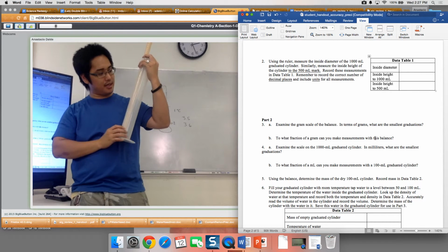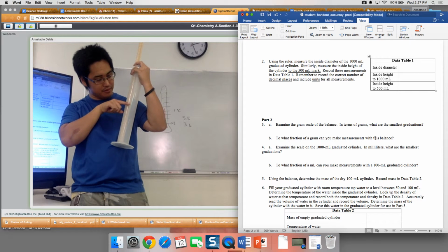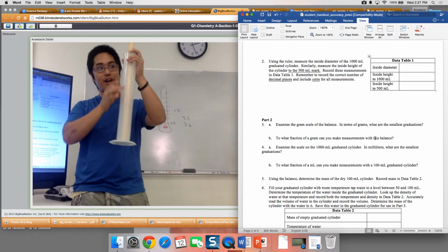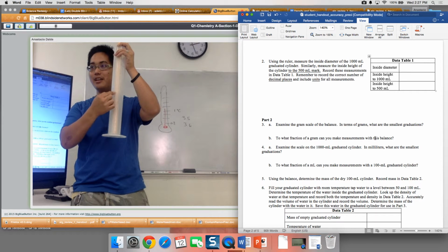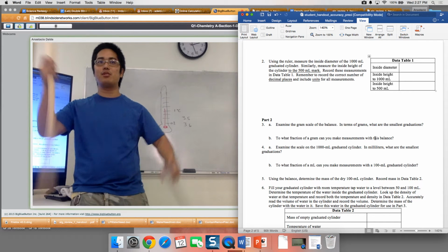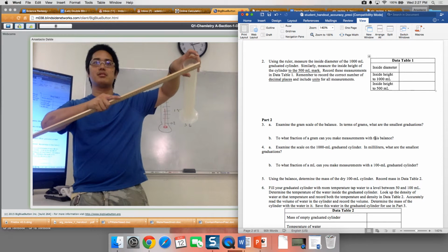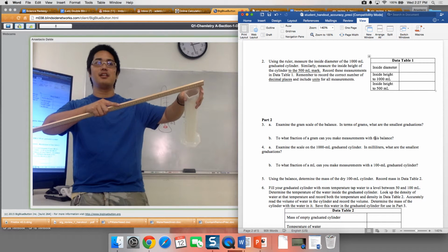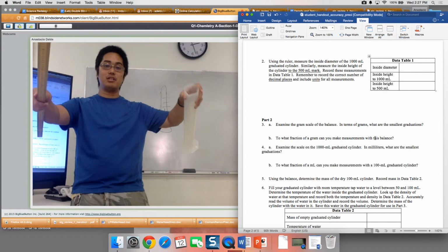And I asked you to get the height of 500 milliliters. Tell me what that is. And from that, you could calculate the volume that's inside this thing, right? Do you guys know the equation? What's the equation of a circle? Starts with pi. Pi r squared. Good. The equation of a circle is pi r squared.